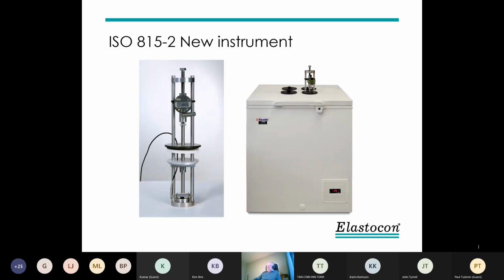Here is an example. It looks a little like a stress relaxation rig, and it's based on the same principle. But here we have the test piece in the bottom. We have some insulation and leads. So we have this sticking up, and the rest is standing on an aluminum plate in the freezer. So we get the temperature transferred from the aluminum plate to the test setup here. We measure temperature very close to the sample. And then we apply a weight which is resting.